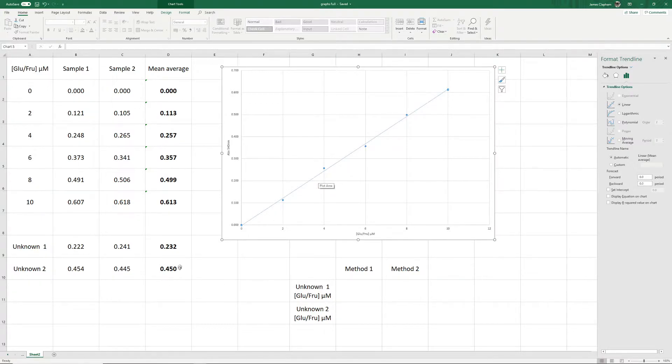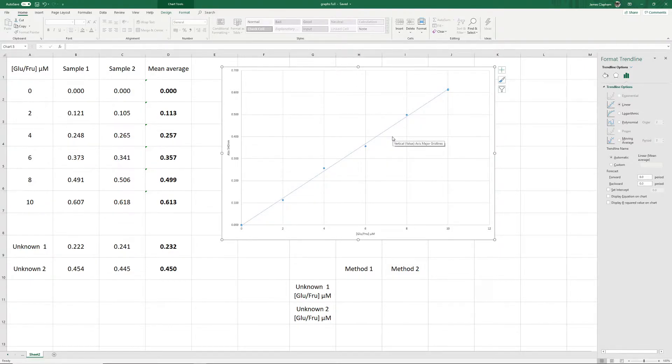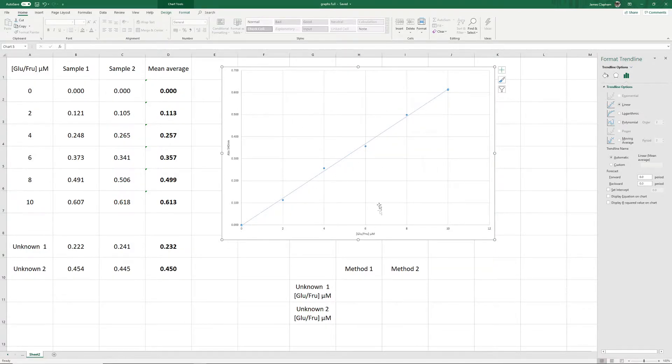And again, for this one 0.45, go up to 0.45, along to the line, down, and it should be 7.6, 7.7, something like that. So doing it manually that way, we can get an idea of what the value is, but it's not very accurate.